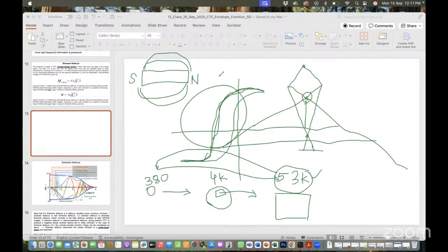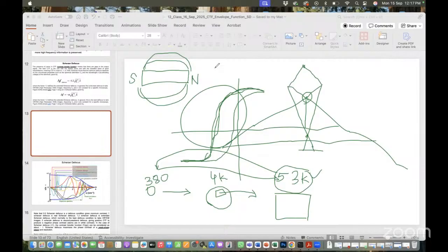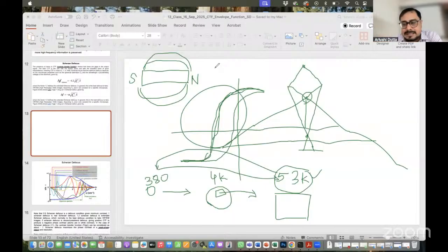Okay, and how do we know if hysteresis is taking place, if it's affecting the current image during the run? For the current image during the run, you have to look at your images. Sometimes in images you can see some kind of pattern or some kind of deformation. Today I don't have any such images with me to share. Maybe next class, I'll try to show a couple of images, showing the difference between lens hysteresis and without hysteresis.